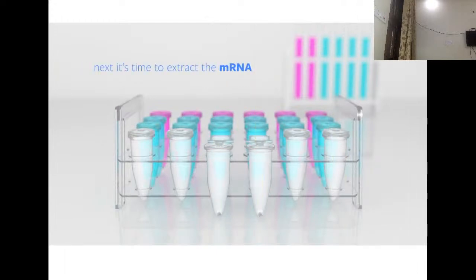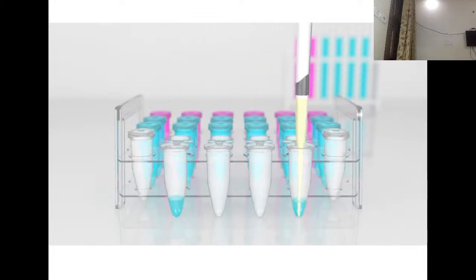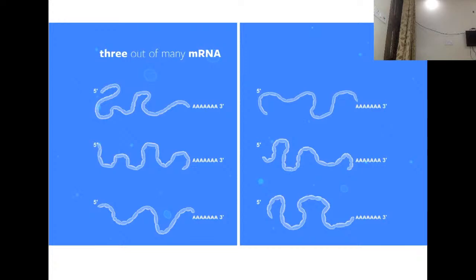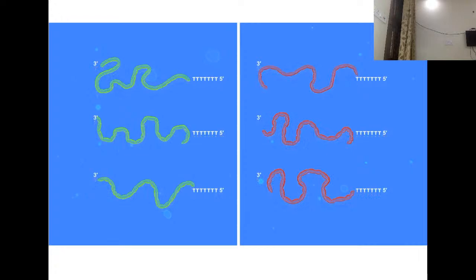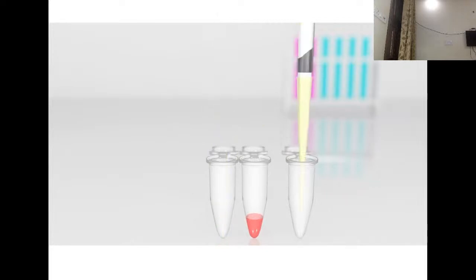Next, it is time to extract the mRNA from the cells. When we add the extraction buffer, the mRNA is released into the solution. Next, we remove the RNA and place it in a fresh tube. Now, let's make the cDNA from the mRNA. Here we see three of the many mRNA molecules from each tube of cells. Each mRNA is converted into red or green-colored cDNA. When the colored cDNA is made, the mRNA degrades. Then we combine the red and green cDNA, mixing both colors into a single tube.